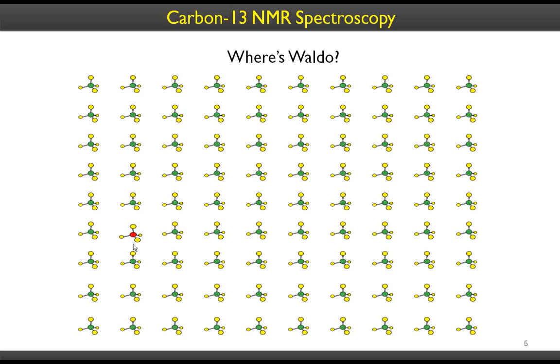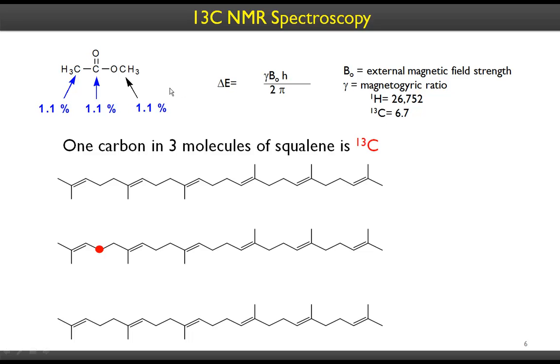So the signal that is generated for carbons is not from carbon-12, it is from carbon-13. And as we know, the abundance of carbon-13 is only about 1.1%. So you need more sample to have enough carbons to produce the signal that you want to see, because it's C13 that produces and it's low in abundance, and the reason why you need more sample, more time, more sophisticated instrumentation to get the C13 NMR spectroscopy.